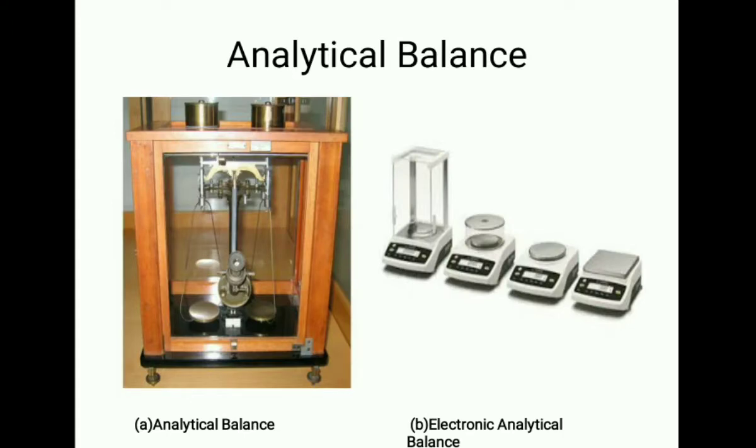As you can see in the figure, on one side we have the traditional analytical balance. Now presently we use electronic analytical balance.